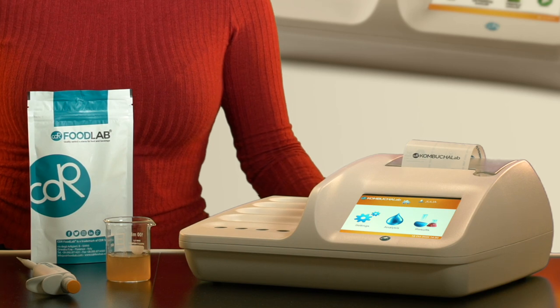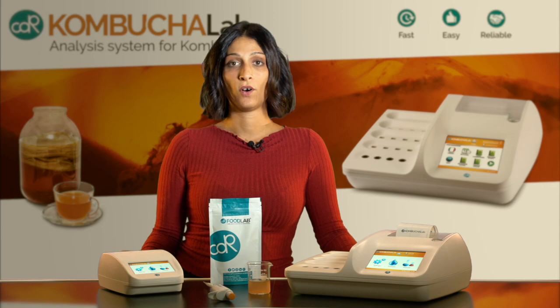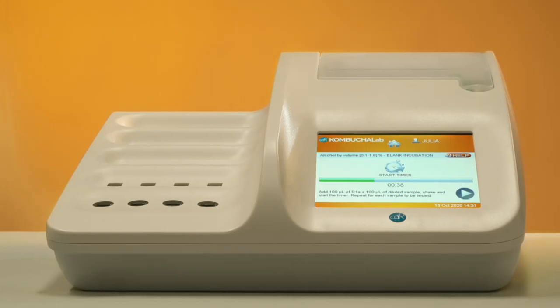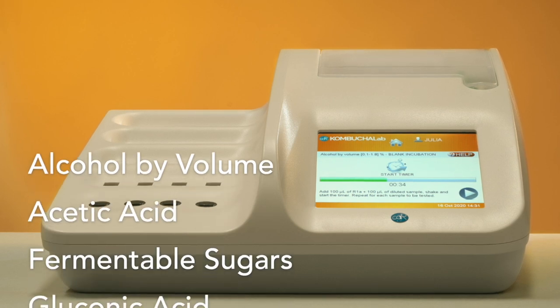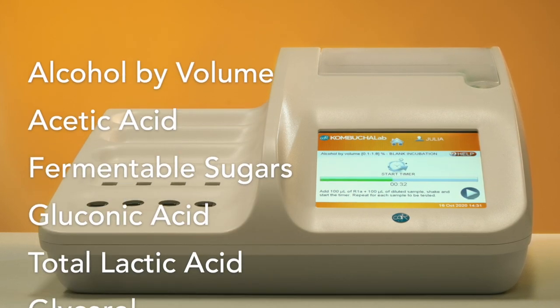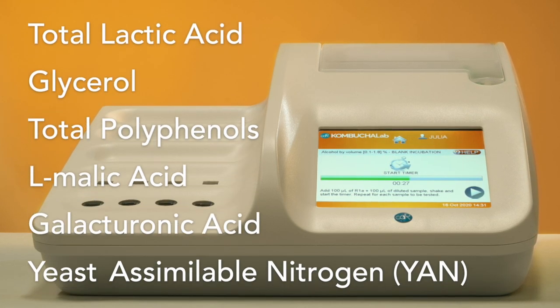With CDR Kombucha Lab, you can perform a wide panel of tests: alcohol by volume, acetic acid, fermentable sugars, gluconic acid, total lactic acid, glycerol, total polyphenols, L-malic acid, and galacturonic acid.